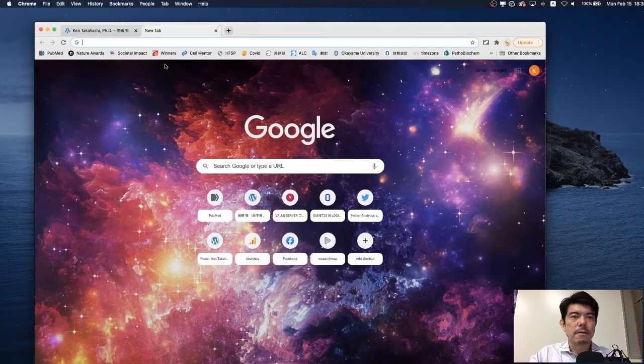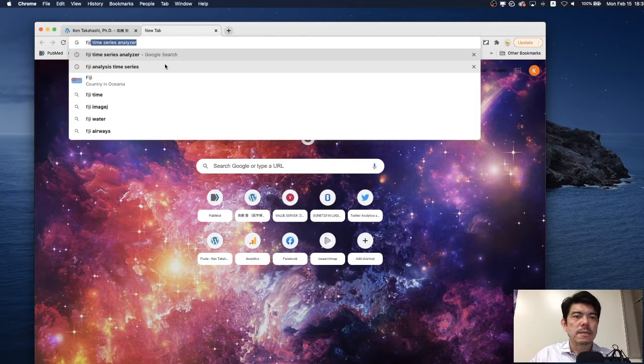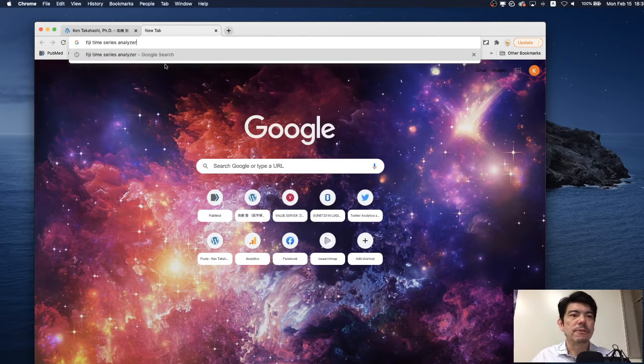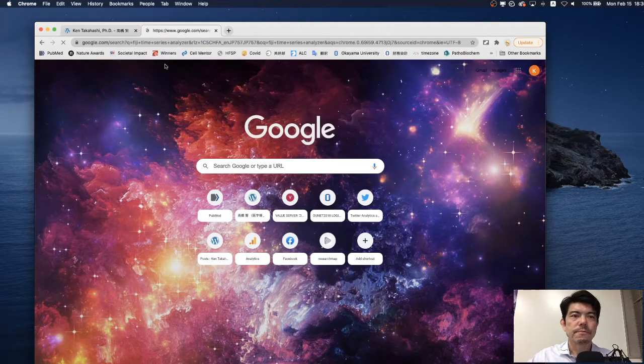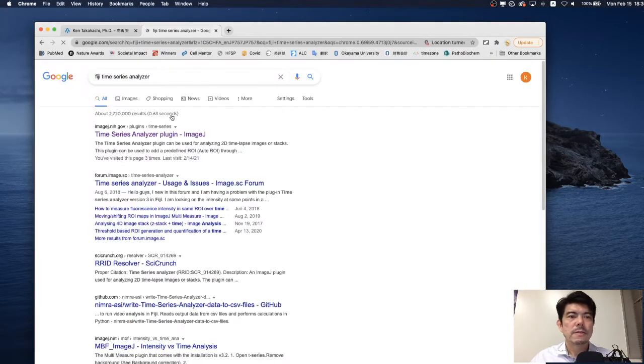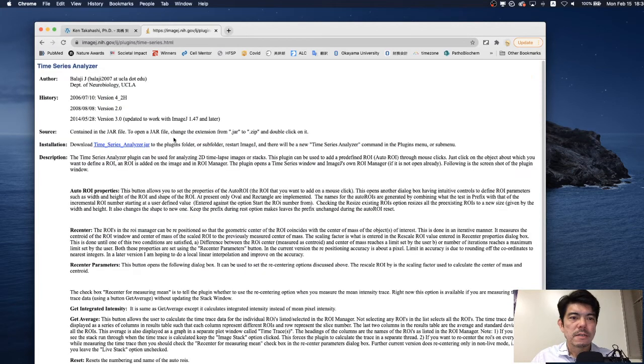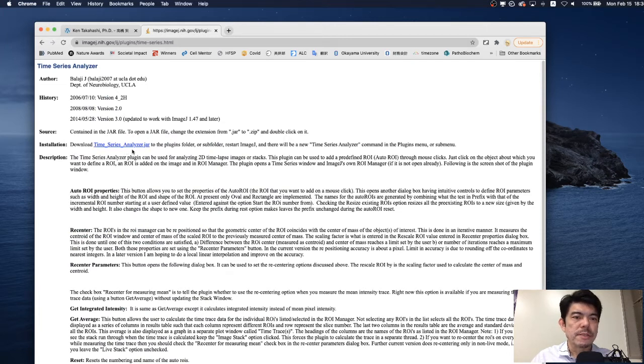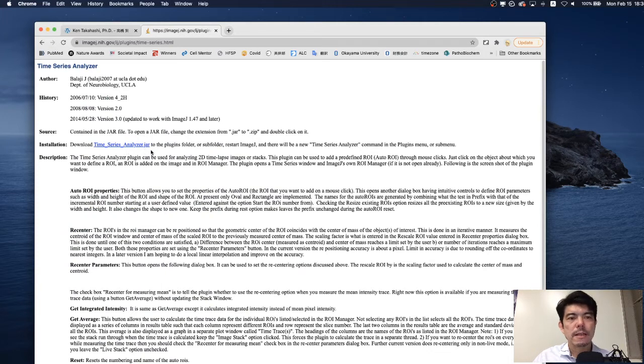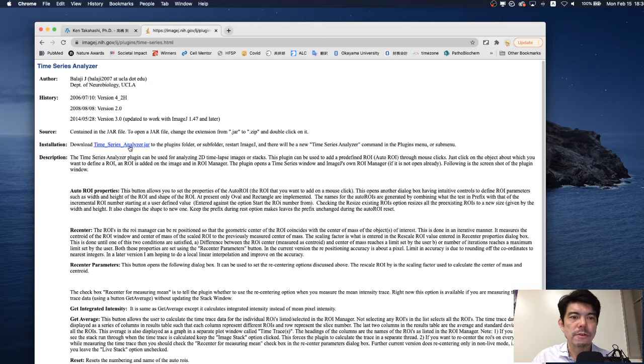Plugin like Fiji Time Series Analyzer and you will find this page. Here you can find the Time Series Analyzer.jar file and now we are going to add this plugin into ImageJ folder.